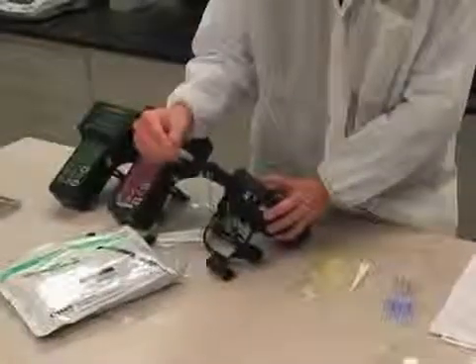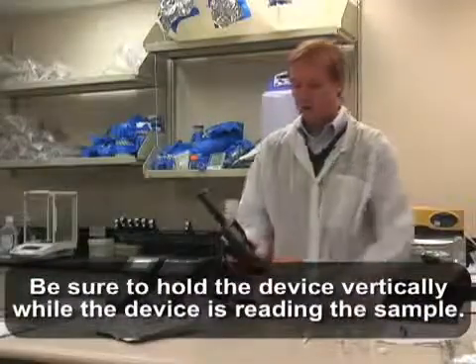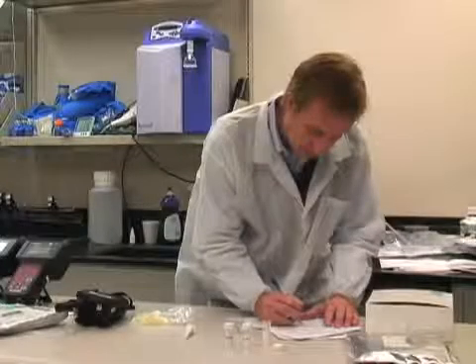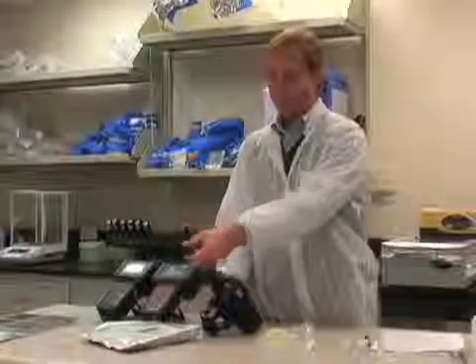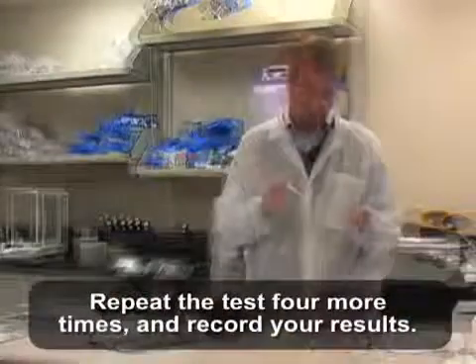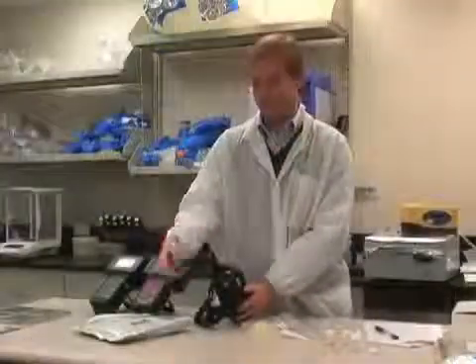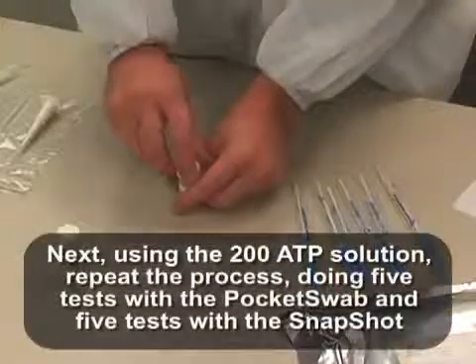Then I'm going to insert it into the Charm device, push the cap down and turn and press OK, just as you normally take a reading with the Charm device. Then I'm going to record the reading on the record data sheet and whether it passed or failed. After you get your reading, you just twist the cap, it pops off, remove the Snapshot swab, and do your next test. When that's done, then I'll go to the vial containing 200 femtomoles of ATP.